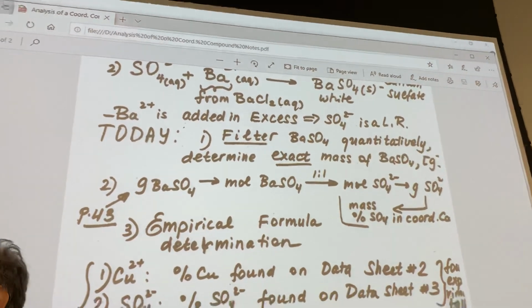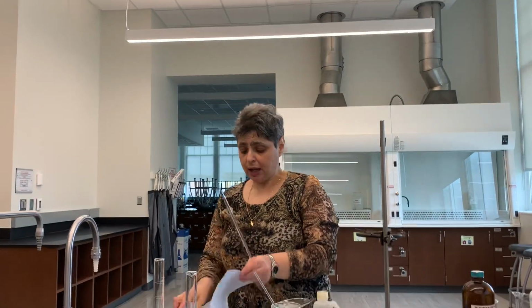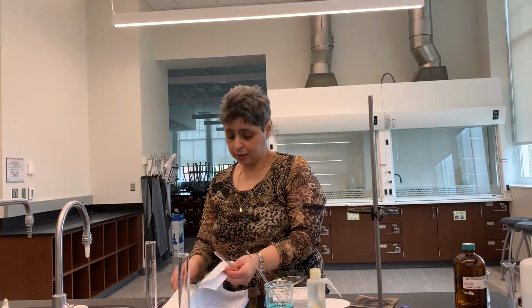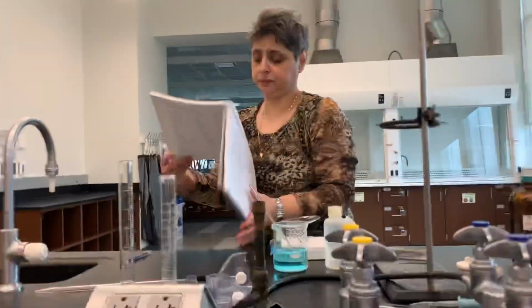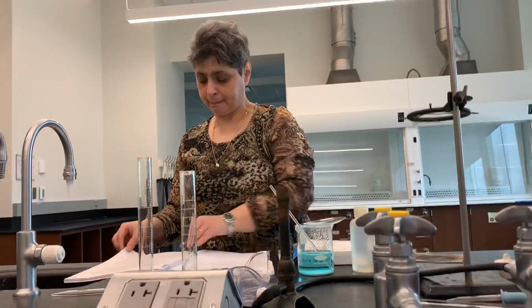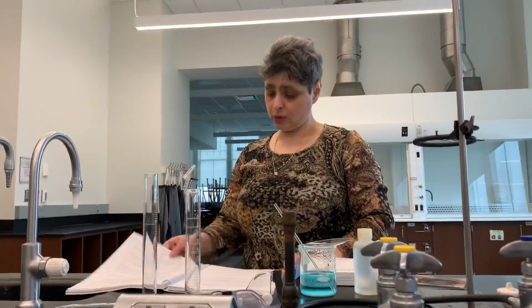I would like to ask you to take a look at data sheet number 3 in your lab manual. I'm going to find it here real quick. Everything I just described in terms of the stoichiometry and the calculations you have to do, you will find all the equations on page 94 of your lab manual.